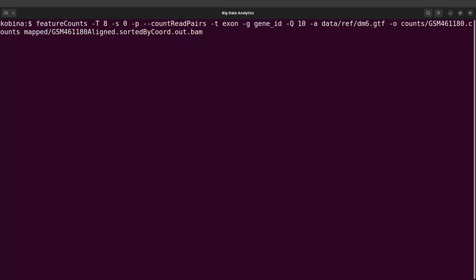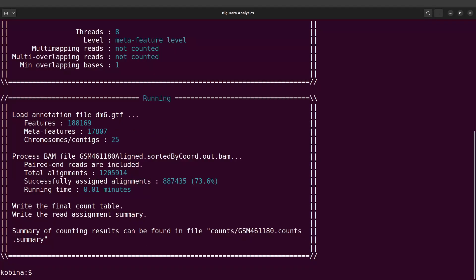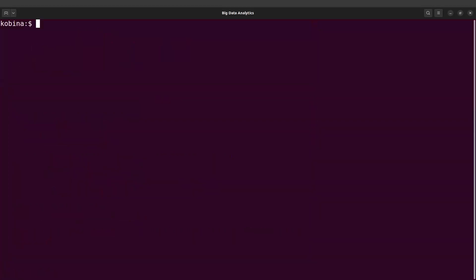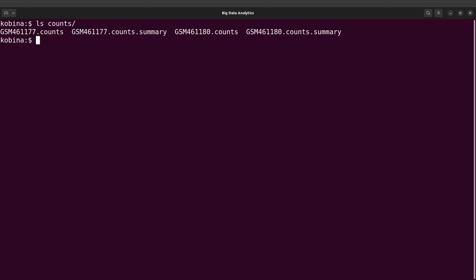Let's run this command. That has also been done. Let's clear the screen and do an ls into counts. We are going to find that one also here. So we have them also here.